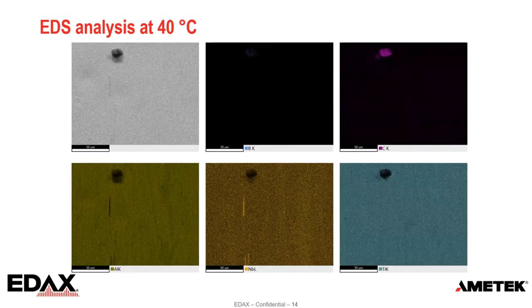The single element maps are shown here, and the first map is the CPS map, where we can get topographic information about the surface of the material. The map of boron and carbon is distributed in the region where the particle is located, and aluminum and titanium. The titanium map shows a homogeneous distribution. And you can see in the map of niobium that niobium is wetted in the scratches and is also distributed homogeneously on the surface.